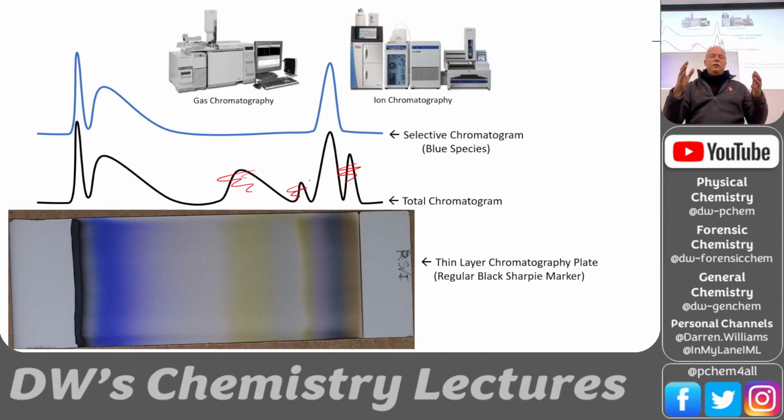Well, very easily, we could separate on color based on wavelength. So let's say we had a UV vis detector on there, and we tuned the wavelength to see just the blue. So only the blue signal would come through, and we could get rid of all the other crazy stuff. That's really helpful if we had a co-elution. Like, what if we had a little peak here and a big peak here, and the big one was blue, but this little guy was red? If we tuned our selective detector to only blue, then we wouldn't have this red signal. And it would just ignore it because it's at a different wavelength.